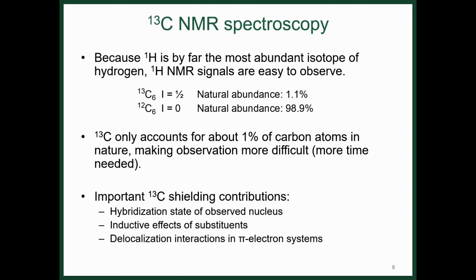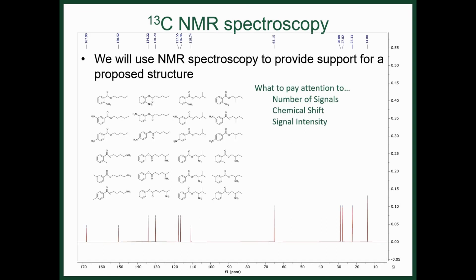All right. So once you have a good handle on C13 spectroscopy, you can probably come back to this slide, and if you're given a C13 data set like the first one that we started with for our C12H17NO2 molecular formula, you could probably narrow down from all of these possible structures I've shown on the slide here to at least one or two possibilities, just given the C13 data set shown right here.